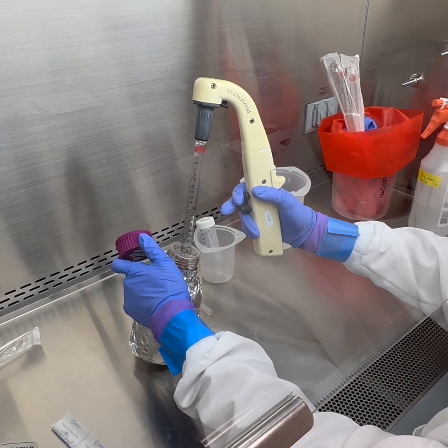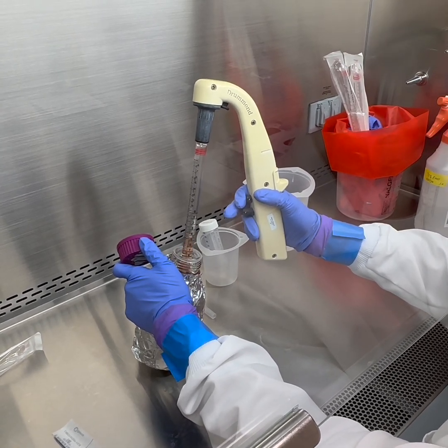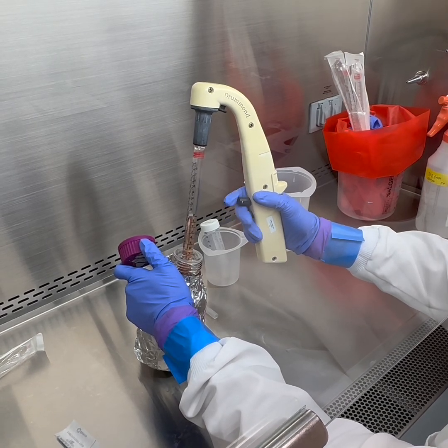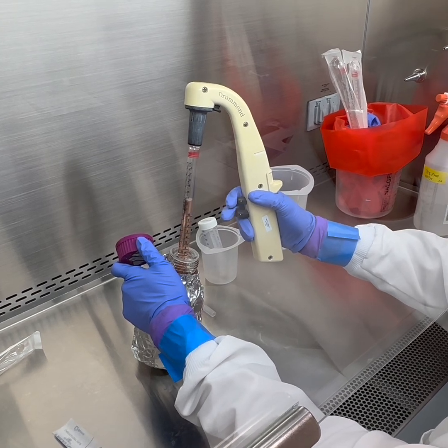So I'm just going to mix this a little bit. I don't know if anything settles in this. We have it covered with tin foil because it's light sensitive, so make sure to keep it out of the light. So I'm just going to do about 30.